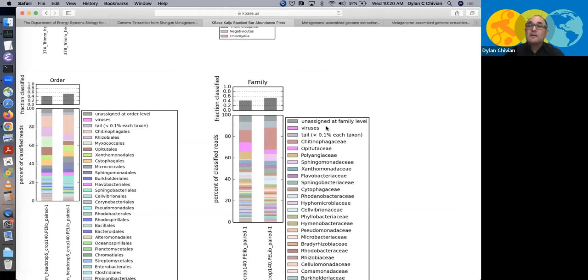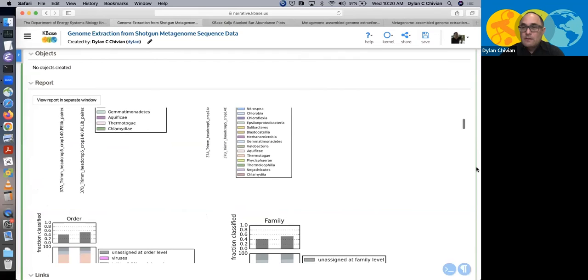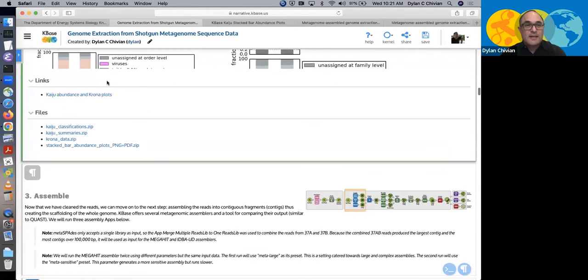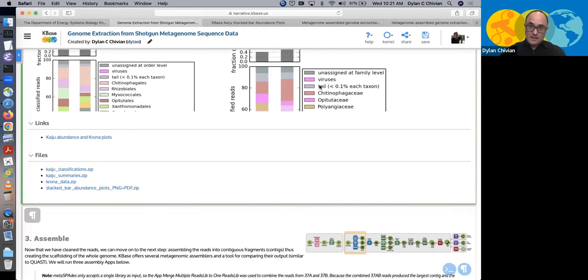And when you go to look at the report, there are, in fact, files you can download that will include the unbucketed tail. So you will be able to get that information for the download. It's just not in a table. You just can't see it in the plot.